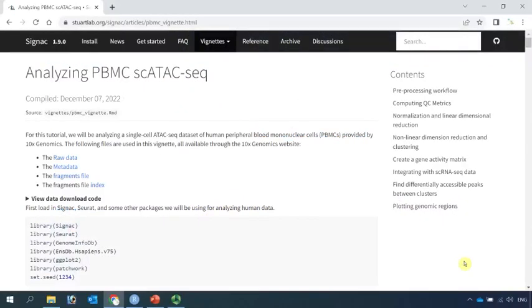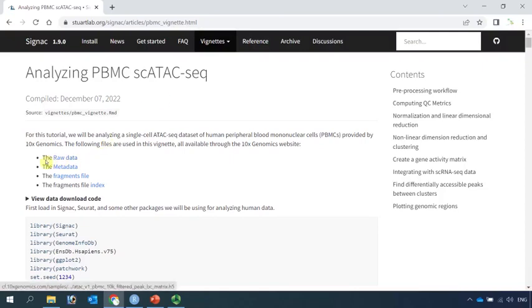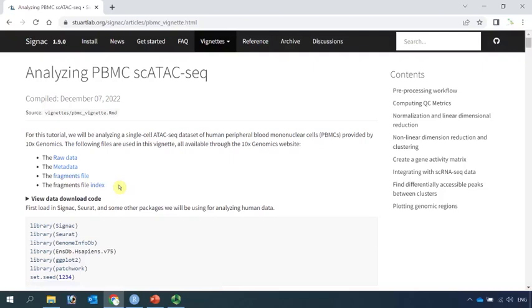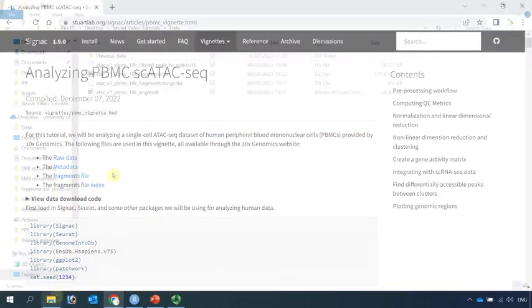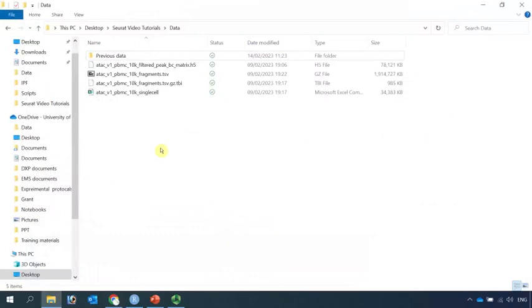For today's video tutorial, I'm going to use the online PBMC single-cell ATAC-seq tutorial. We can download the matrix data, the metadata, and the fragment file, and also the index for the fragment file from here. You can see here, I downloaded the files already. We can go ahead to perform the analysis in R.